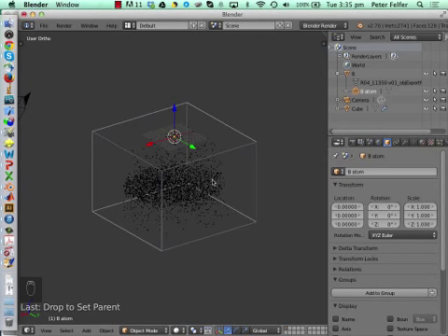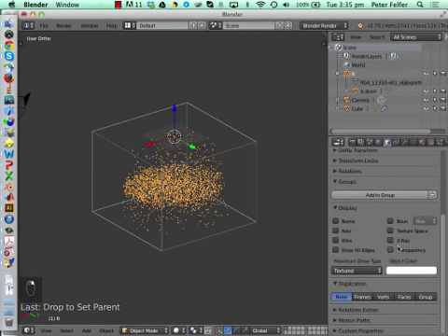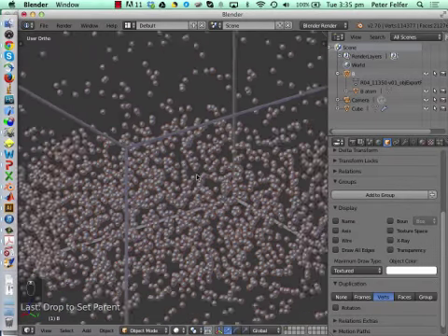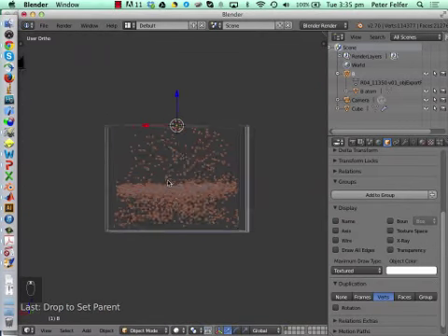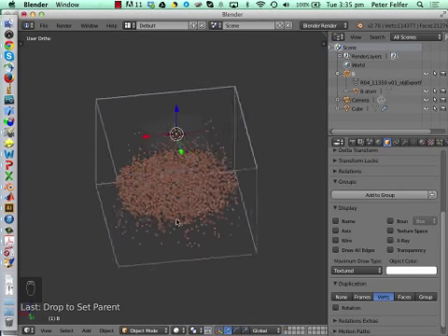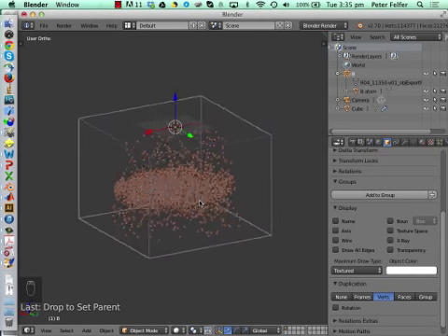That's how we're going to visualize the atoms. Wait for the next step, okay? So we've made it a child of the boron. And now we go and click on the boron and click vertex duplication. So the icosphere as a child of the boron is now copied onto every vertex of the boron, and that's exactly what we want. Now we've got it as the proper distribution, right?